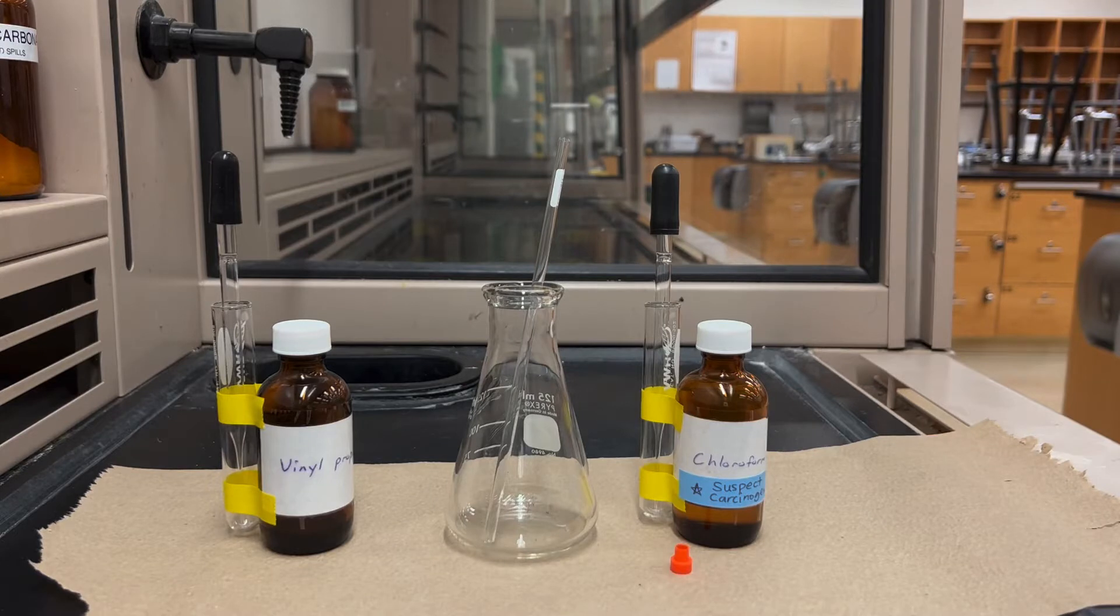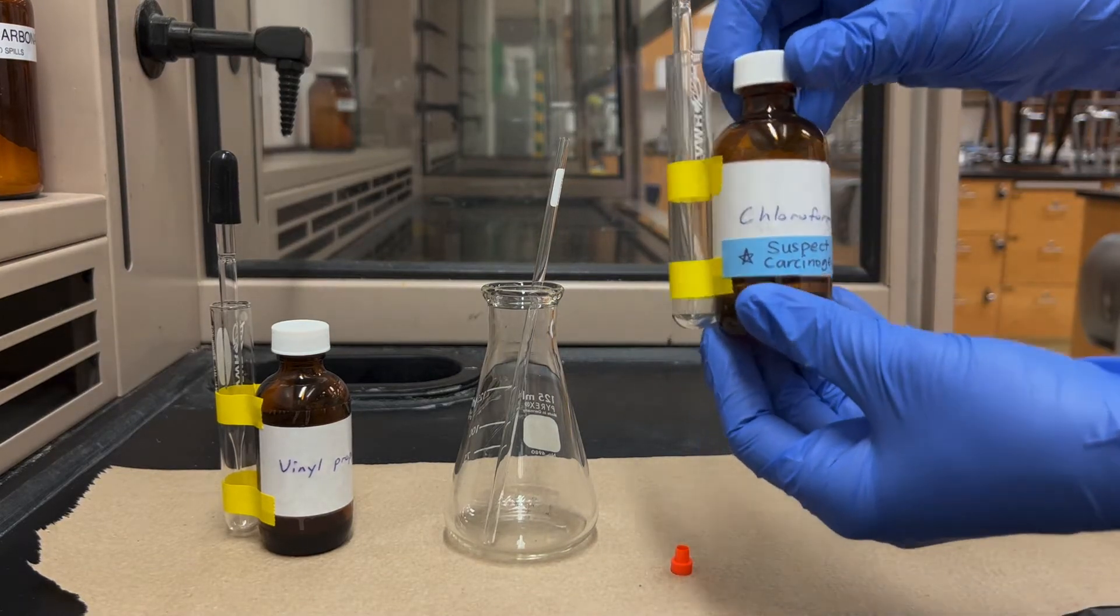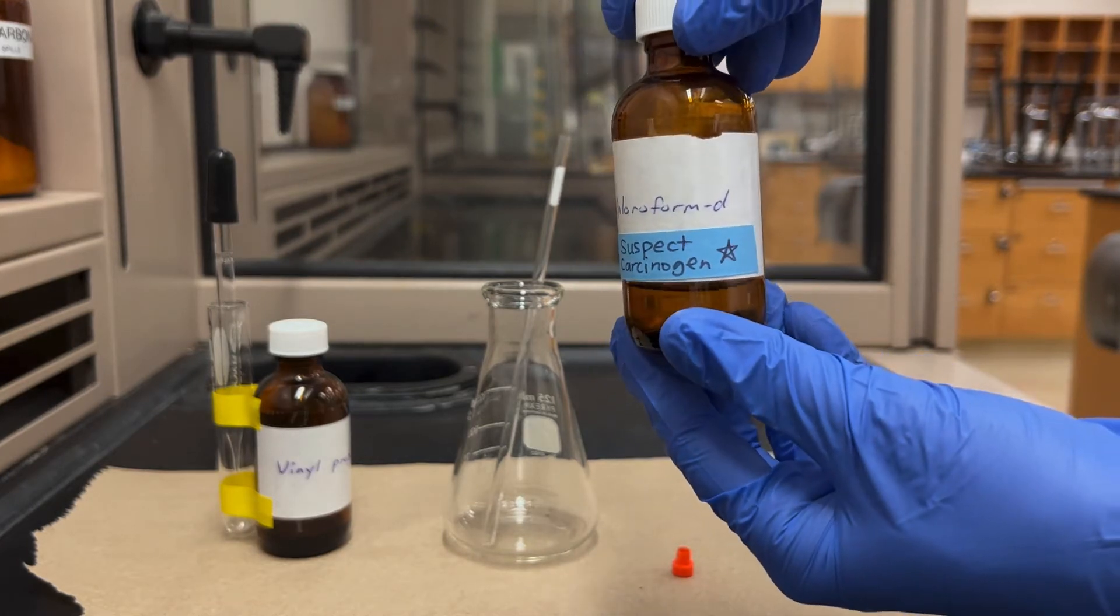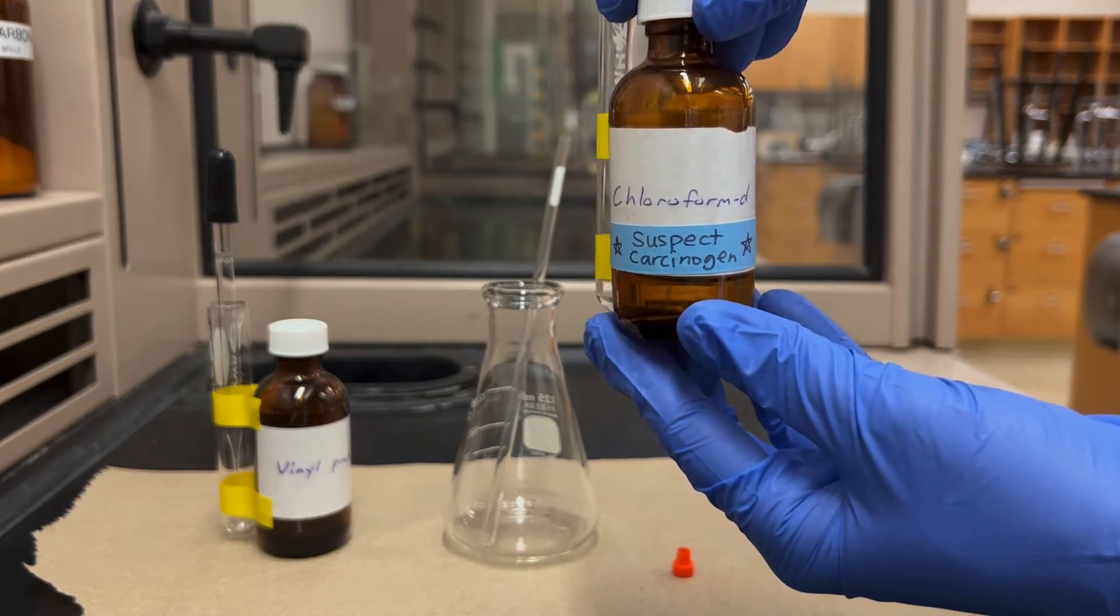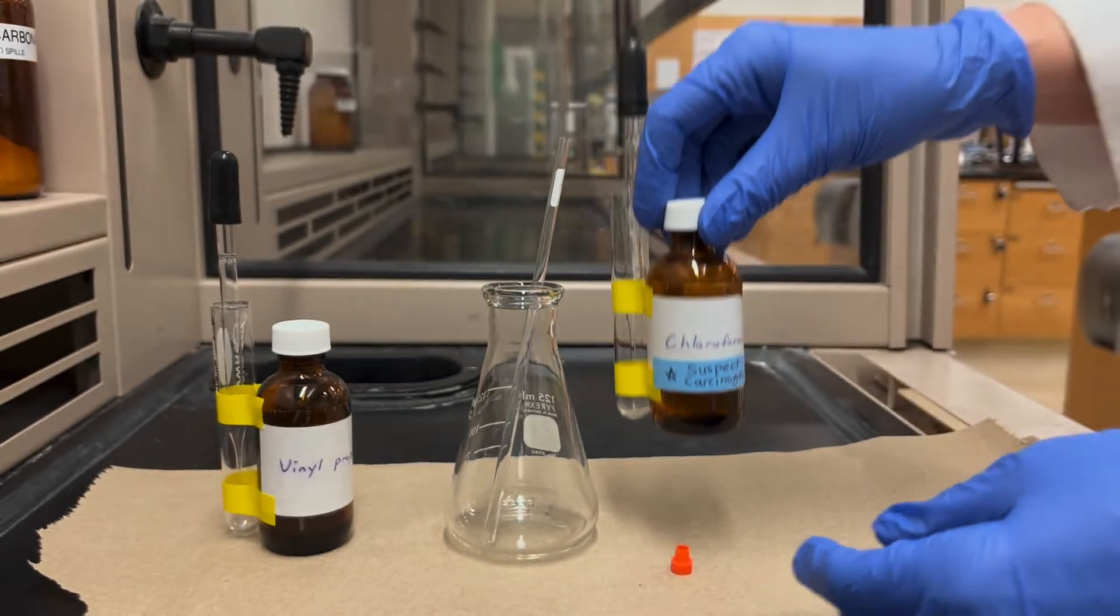I'll first put a clean NMR tube into an Erlenmeyer for support and next I'm going to add my deuterated solvent. I'm going to use deuterochloroform or CDCl3. It's a really common solvent for NMR but this is a pretty hazardous material. It's a suspect carcinogen, so when working with this you do want to wear gloves and work in the fume hood.